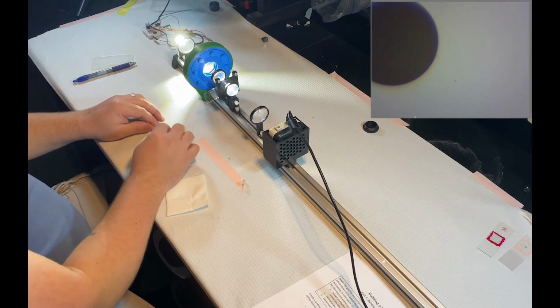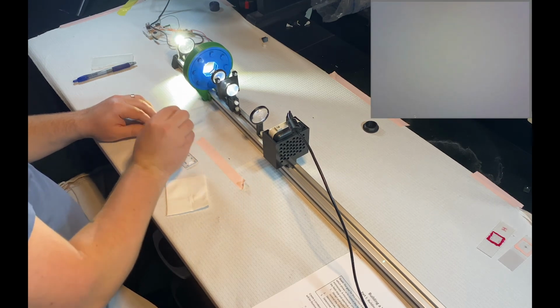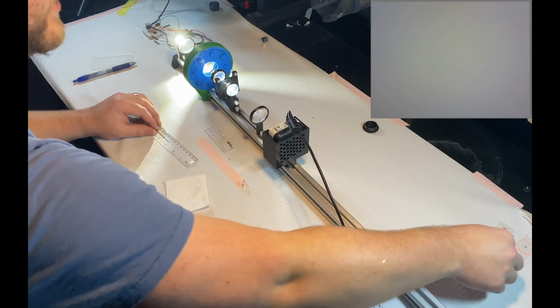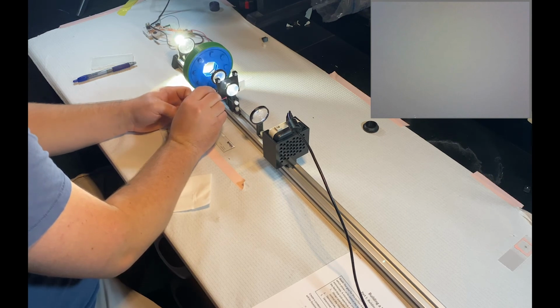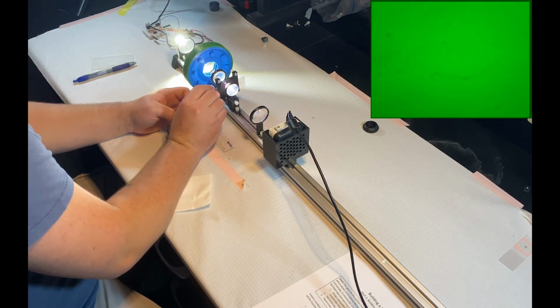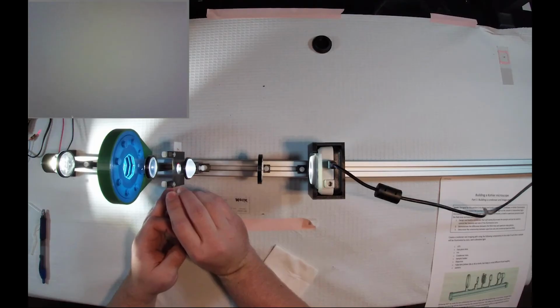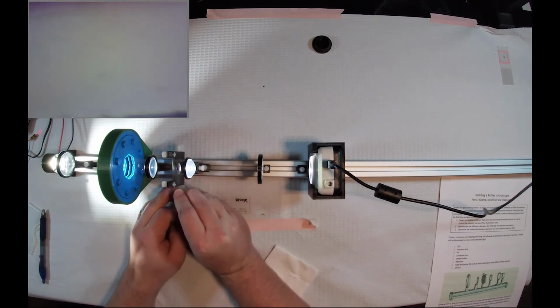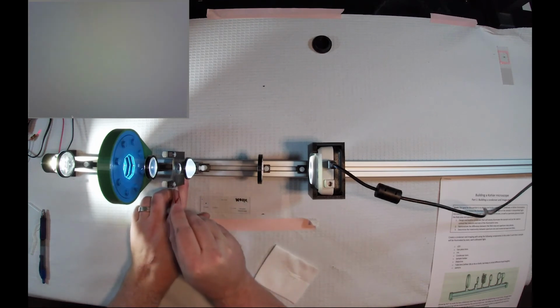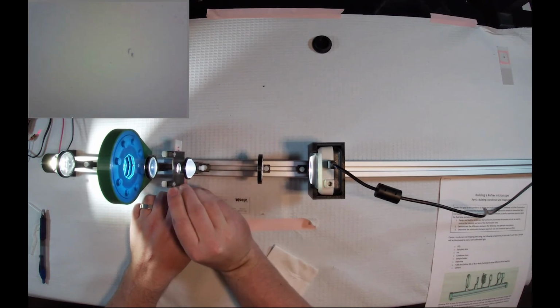And that is everything that the lab asks you to fill out, but it's not super interesting. Just look at dots. So since we have now completed the assembly of a proper Köhler infinity corrected microscope, we could look at more interesting things. I have mounted a few pieces of my hair on a slide. And I'm going to mount that the proper way, just so we can see what this looks like under Brightfield illumination.